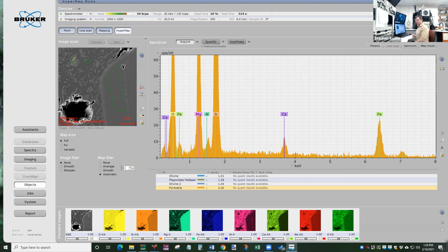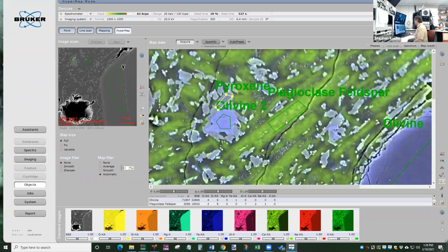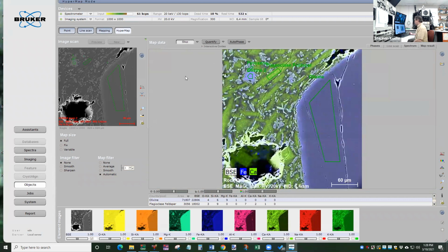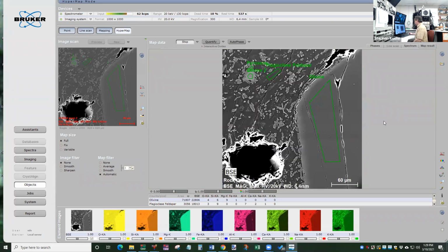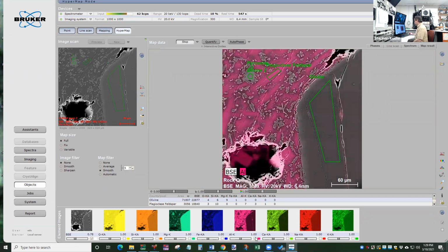And that's actually another common mineral in igneous rocks. Actually, dark ones, medium ones, and light ones, but especially the darker ones. All right. Just put it on our electron image by itself. And we could do other combinations of things.